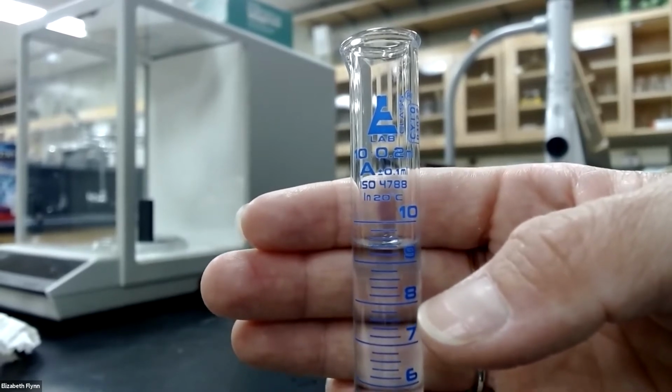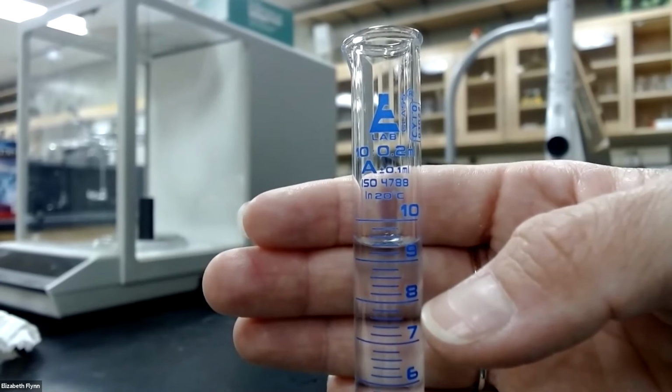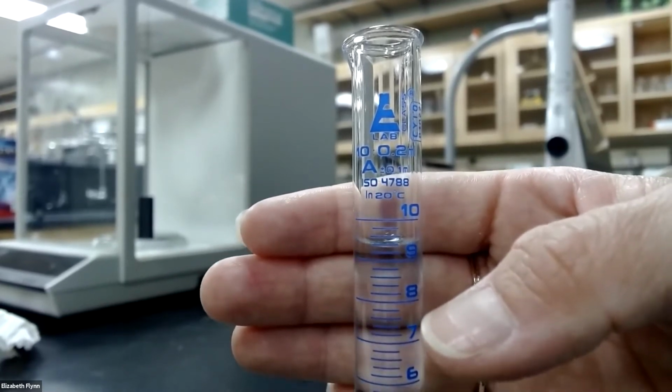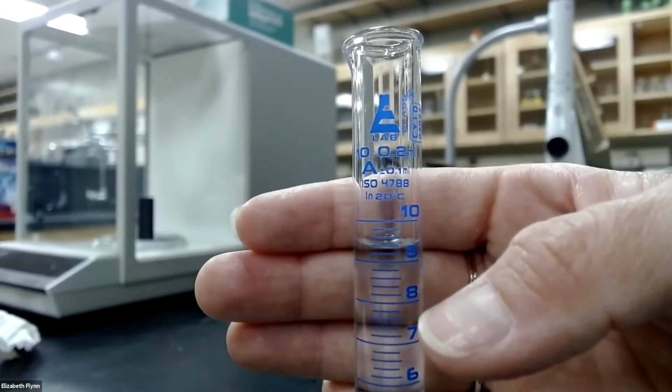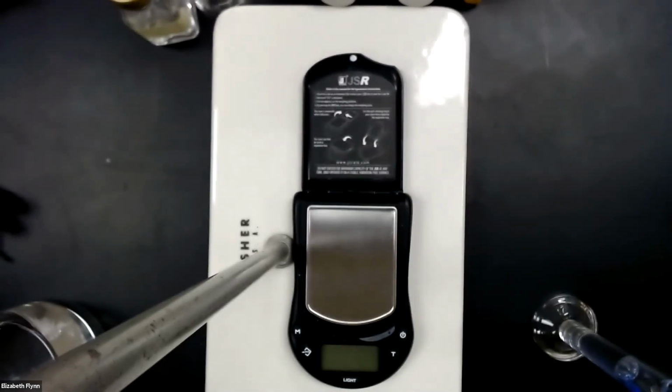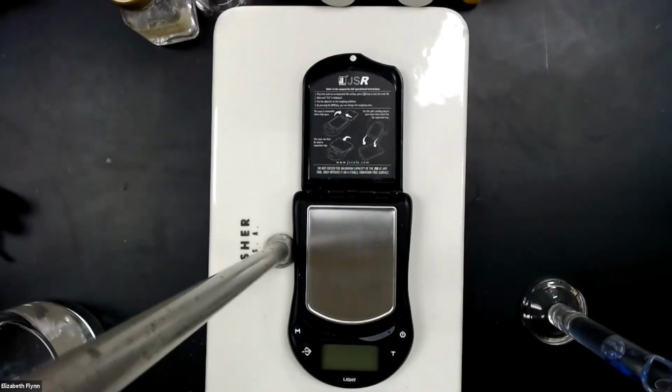So the best we can do with these graduated cylinders is say 9 point what? The bottom of the meniscus, 9.3 milliliters. That's our volume. So 9.3 milliliters is the volume of the water.